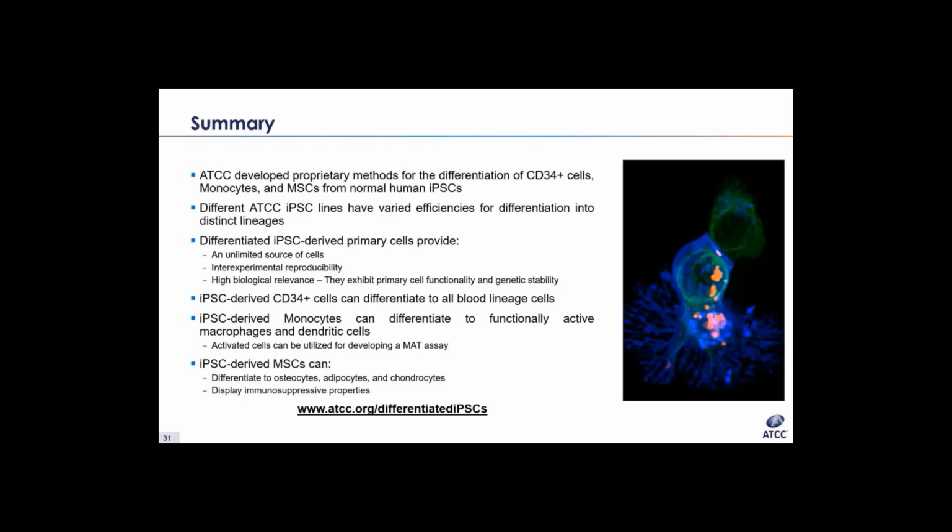Okay. Here's a good question that's definitely current and timely. Can the iPSC-derived cells be used in COVID-19 research, and what are the applications? So this is, again, a really timely question.